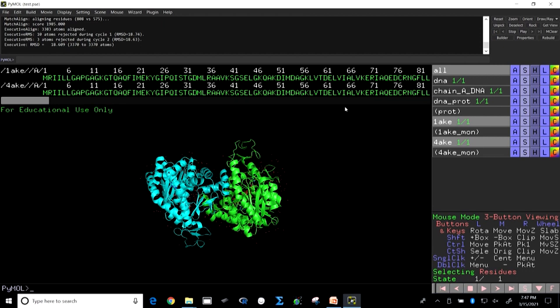Remember, I talked about the symmetries. Whatever the symmetries are, suppose this is a monomer and this is a monomer. It depends on the building up of this symmetry whether those two proteins would be coming like this or that. So, they could be rotating on this screw axis.